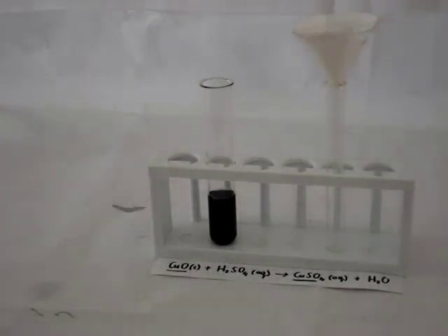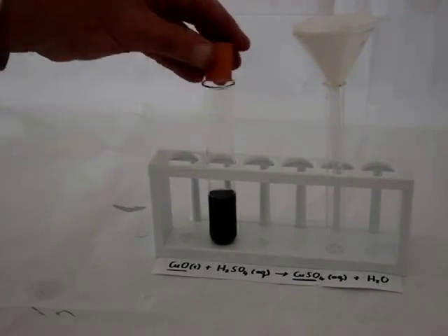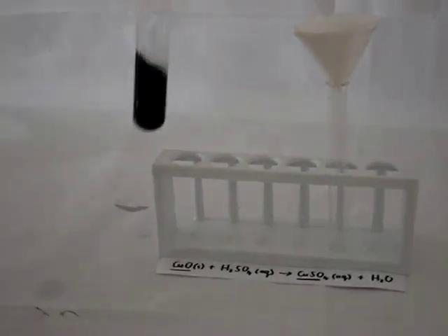Copper sulfate is a blue substance, and although now we can't really see very nicely that it's formed a blue substance, we'll give it a little bit of time, and then we're going to filter what we have over there, the solution over there.